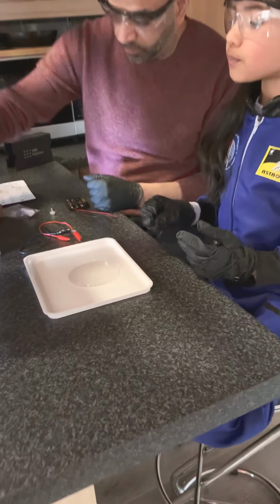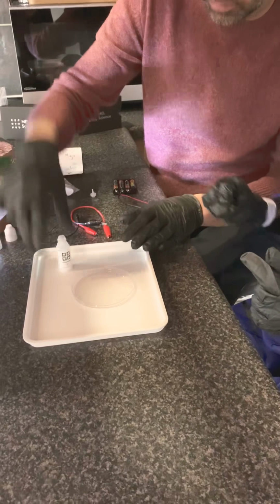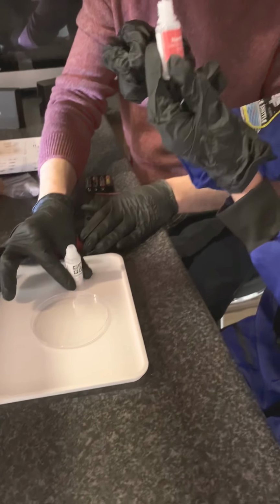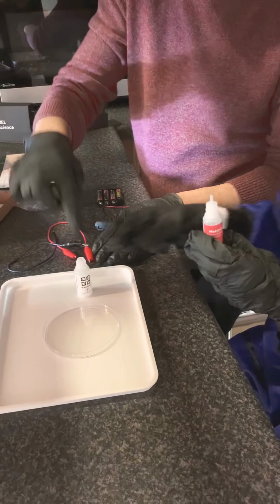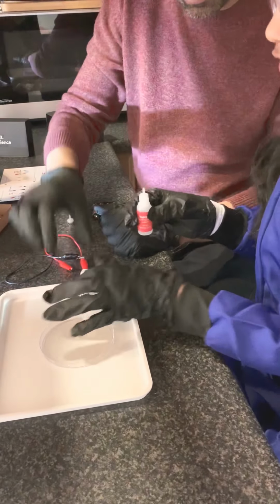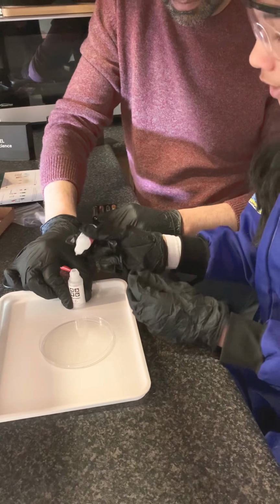So first we need to remove the cap from this bottle over here, which we've already done. I need to pour one bottle of sodium hydrogen sulfate, NaHSO4, into the bottle of tin chloride. So you're just going to pour that in here. I'll hold this for you. We need to pour all of it in here.